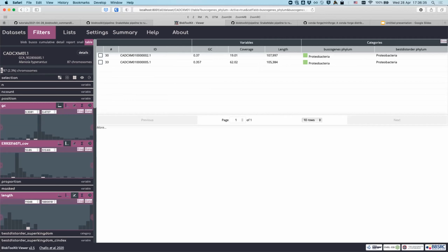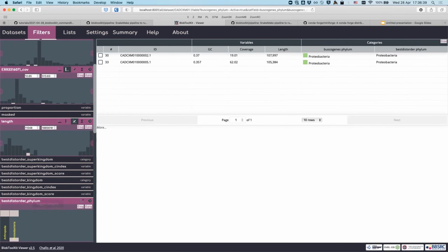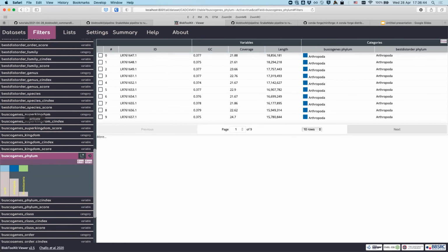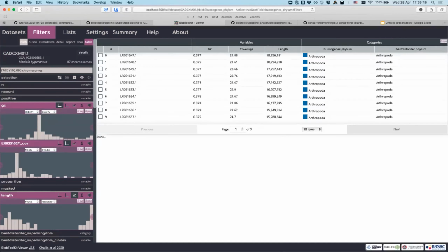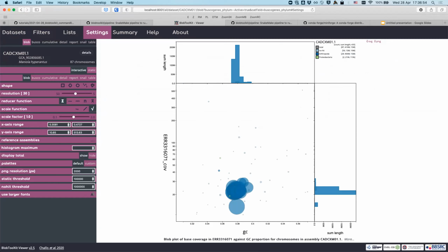The other cool thing that you can do is, go back, reset this filter over here, go back to the blob view, see everything in blob view. There's a new settings type of blob. If you go to settings, along with shape, there is a new one. There was square, hexagon, round, and now there's plot connected windows.